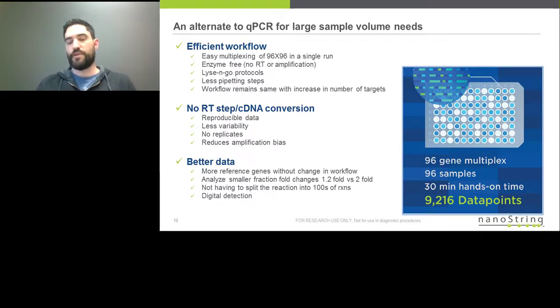So instead of doing 800 genes, we shrunk that down to about 96 genes per sample, and you can even go less than that. In a typical run, you'd have those 96 genes and look at 96 different samples at a time. And 96 is a number most of us are very comfortable with, working with 8 times 12 sample plates in those grids.